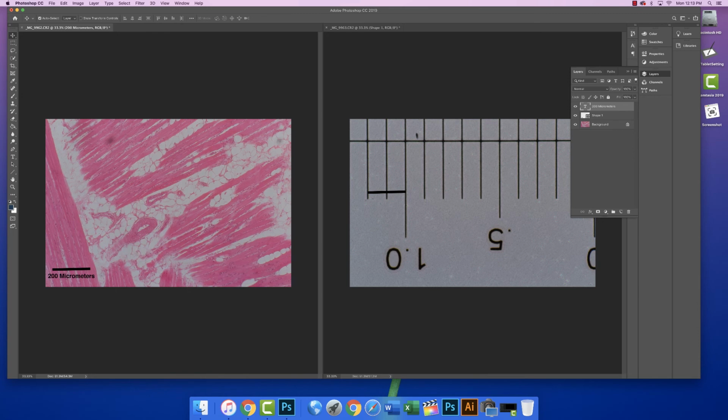I don't know, that looks like it's at an angle. Maybe I didn't draw it correctly. Let me try again. I'll draw another one. Maybe I didn't have the shift down correctly. So I set my cursor in the middle of one line, I stretch it out, and then I can hit the Shift key, and that should make it perfectly horizontal. Yeah, this one looks better.